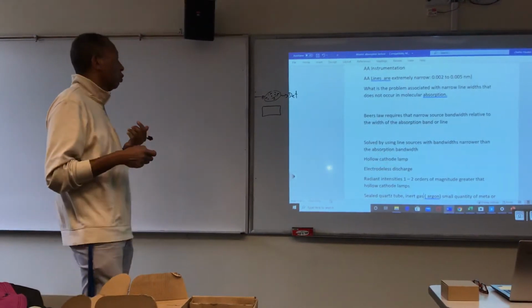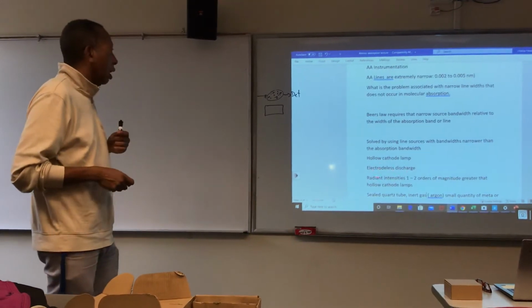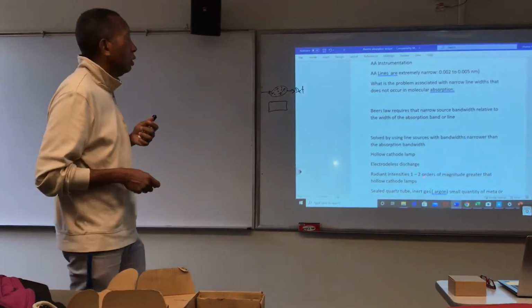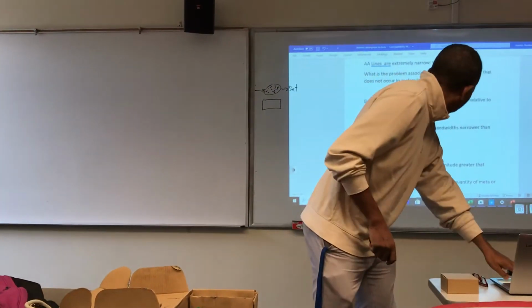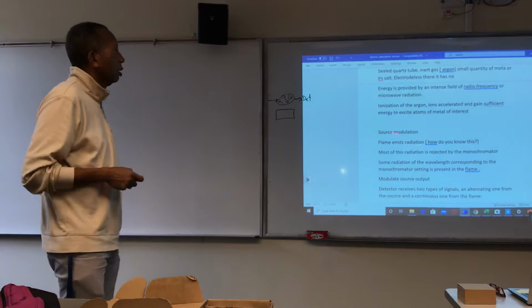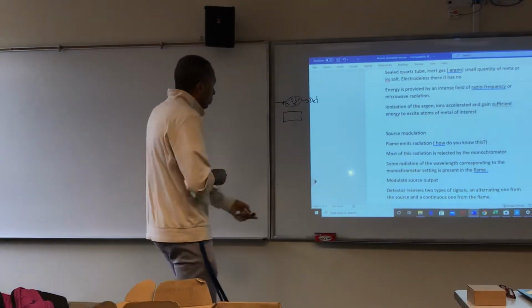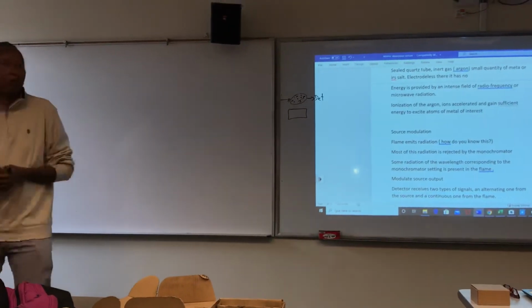Then there's the electrodeless discharge lamp, which we talked about before. The electrodeless discharge lamp has the advantage that it's one to two orders of magnitude greater than the hollow cathode lamp. We talked about what that is already. Then source modulation, remember we hinted at source modulation, which is to modulate is simply to change frequency.